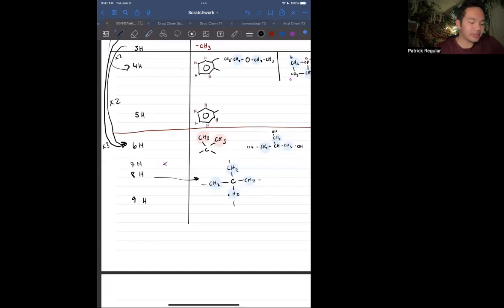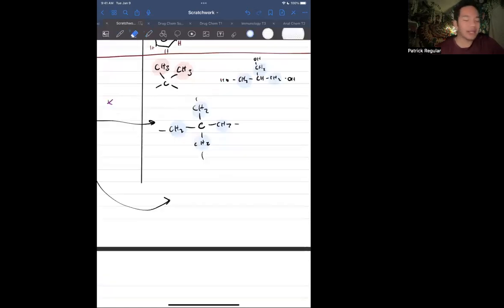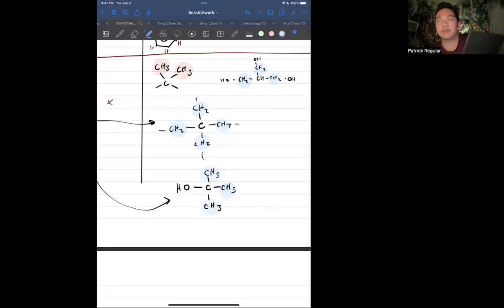Now let's look at this last one. This one's, we're bringing it back to easy. This one is just most likely going to be a tert-butyl group. CH3, CH3, CH3. It's like tert-butanol, my bad. These CH3s are chemically equivalent. They are equidistant to OH. Each of them have 3H integration, but obviously you put them all together in the same NMR because they're chemically equivalent. They're going to be showing up as a 9H. Just for some speculation, in this one, this would be a 9H singlet.